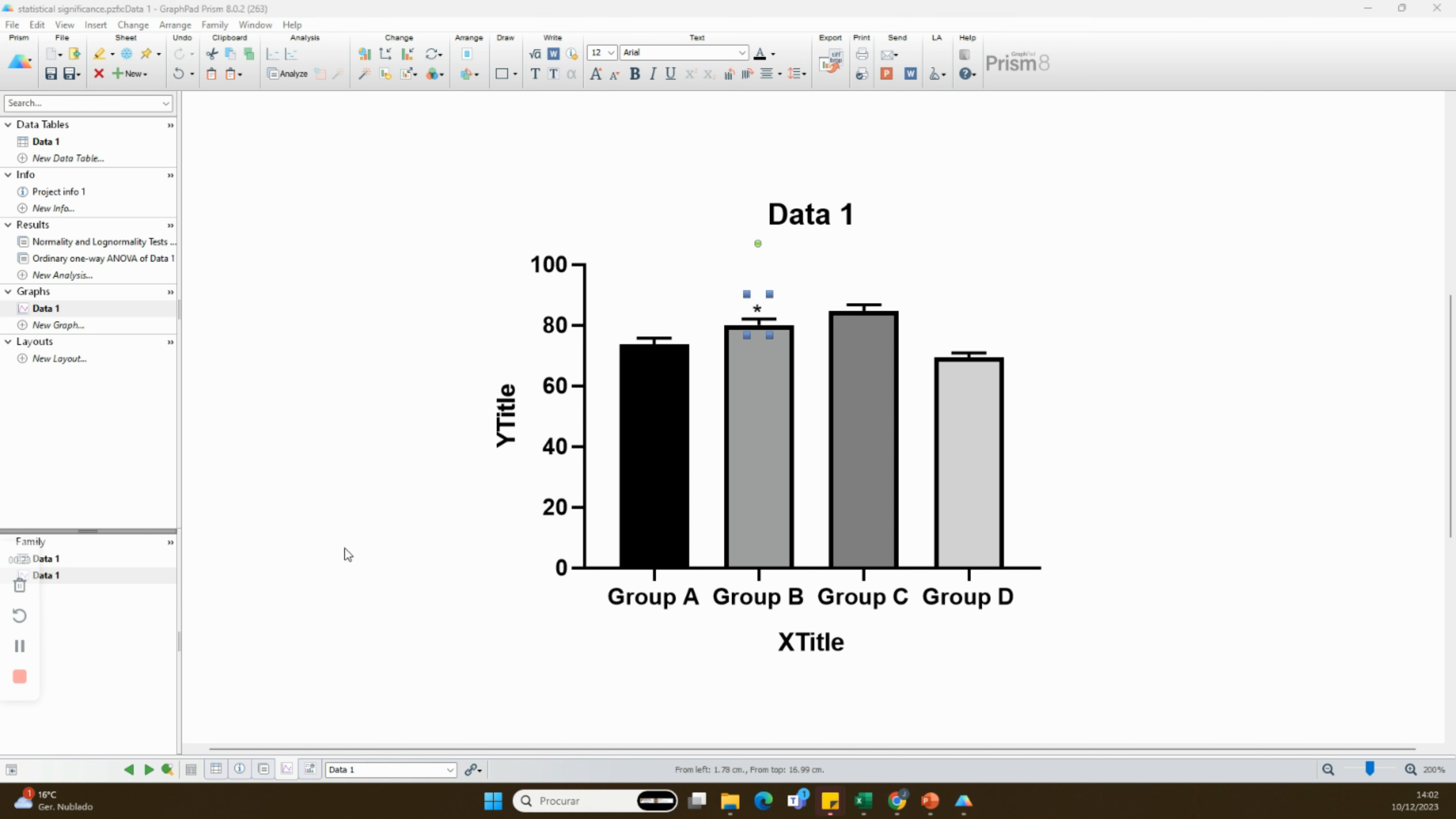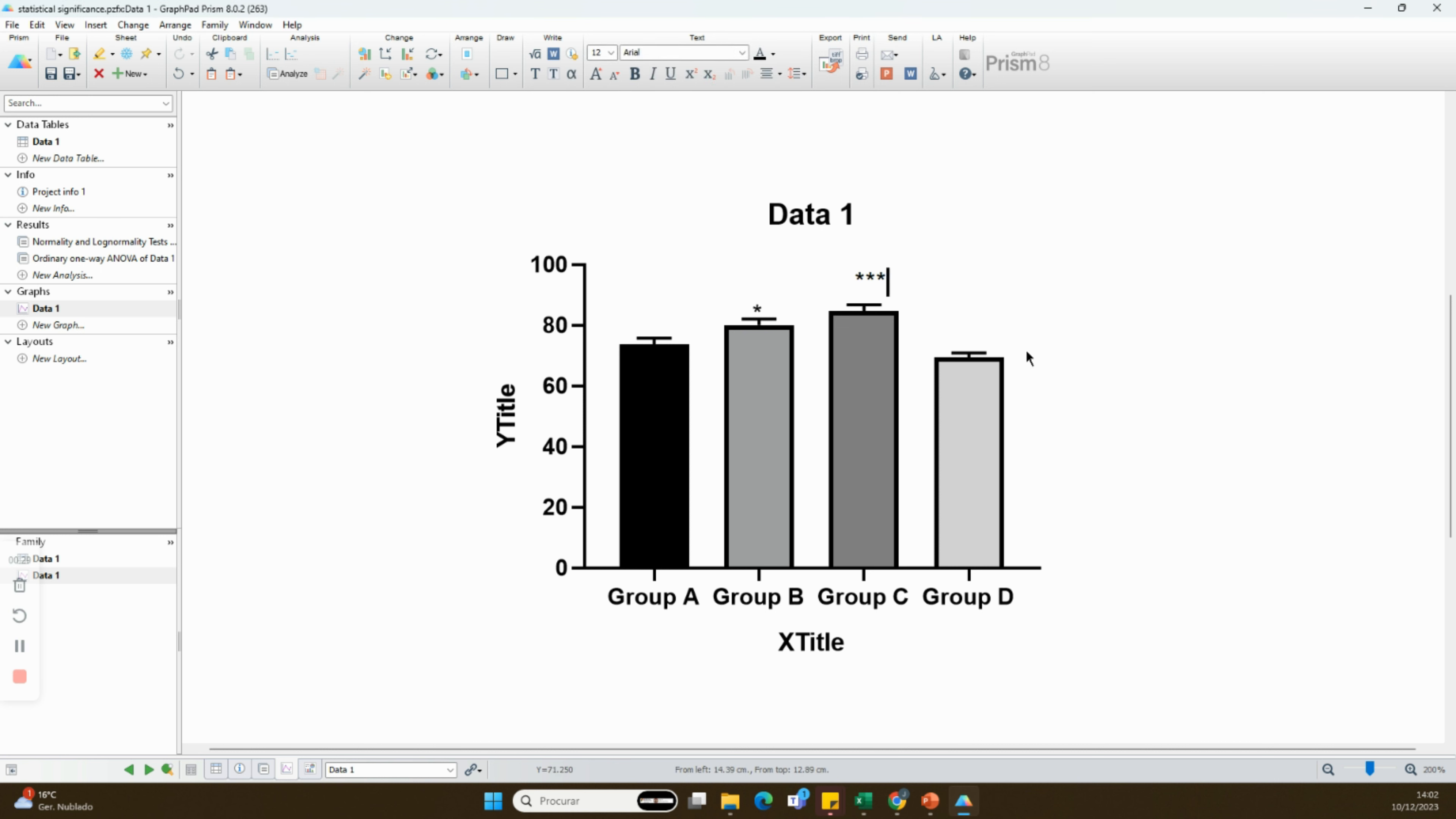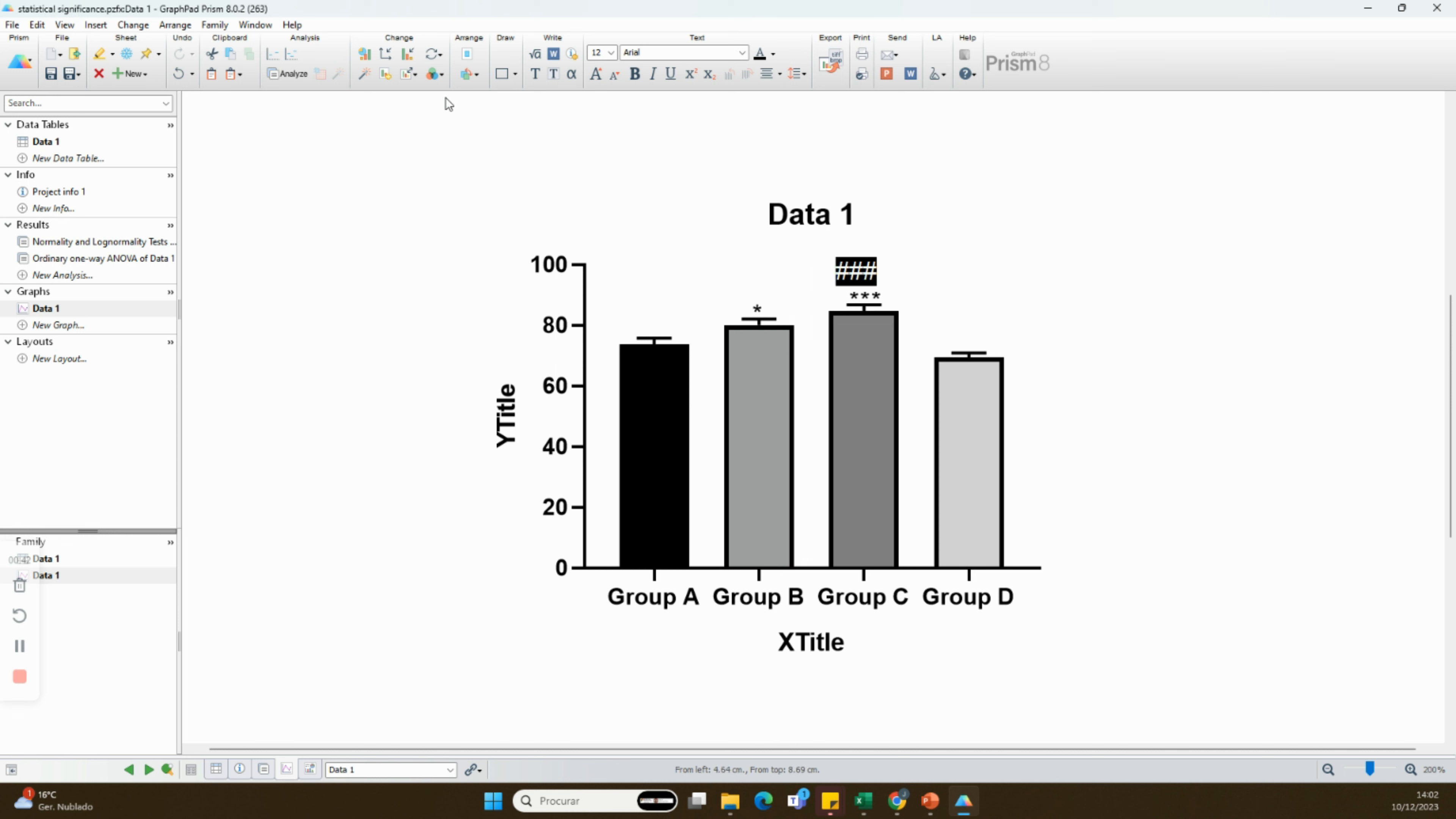The ANOVA denotes different degrees of statistical significance between each group. One of the ways to display them is to represent the difference between a specific group and the other ones by a specific symbol.